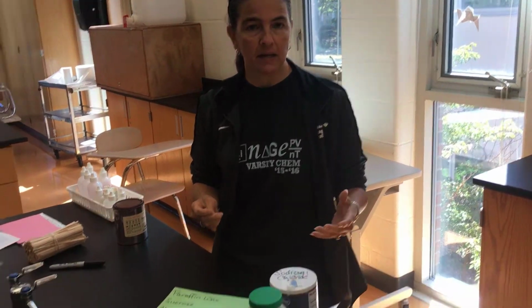Hi there. So we're going to start a challenging lab called What's in the Bottle. The goal here is eventually we're going to give you 4 samples, or show you digitally 4 samples of things that you don't have to figure out what they are, but you have to figure out what type of bonding they have. So in order to get to where you can do the unknowns, we're going to start with some knowns, and you should be able to figure out from what you see in the names of these what their basic type of bonding is.